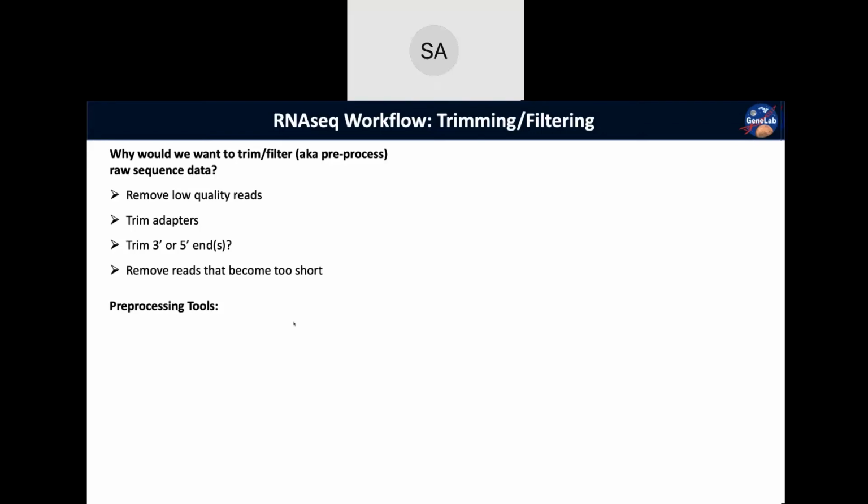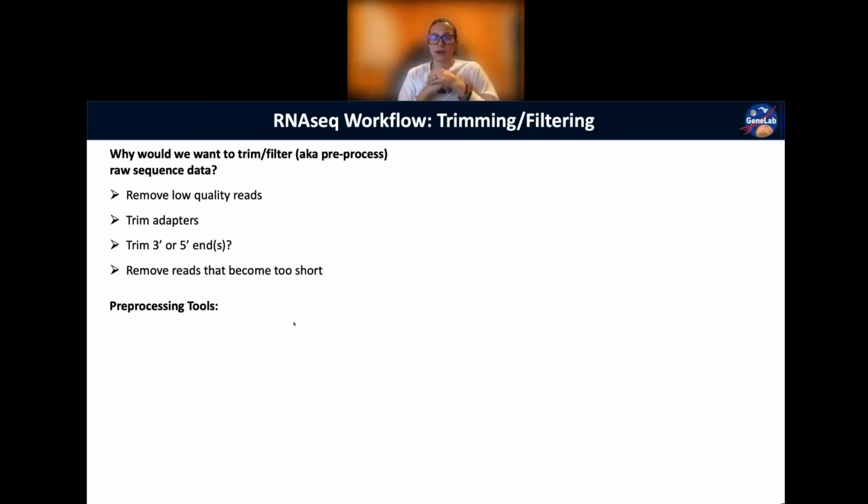They're reads that only appear once, so entirely unique sequences that could be some sort of contamination. Oh, that's actually a really good thing. When we have just one copy of a sequence and no duplicate of it, it probably came from a certain transcript. It might just be lowly expressed. So if we only have one copy, it could just be a lowly expressed transcript, so we don't see multiple copies of that same sequence. So that's not a problem in RNA-seq.